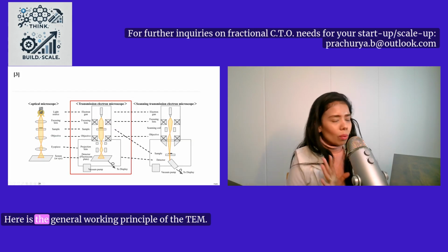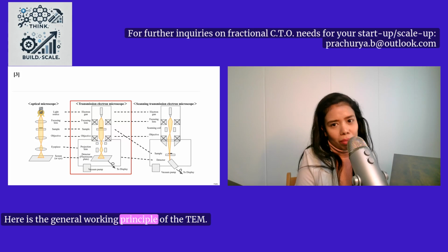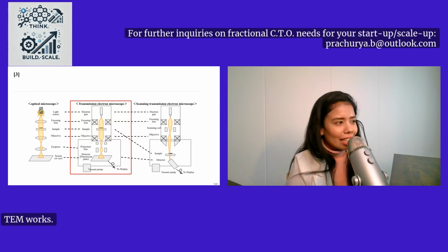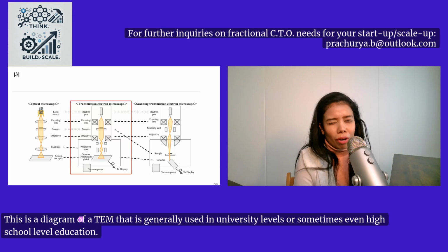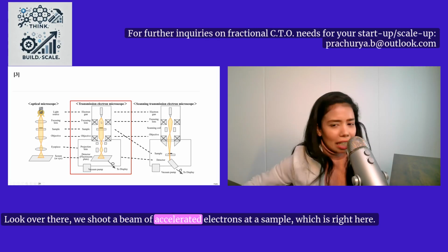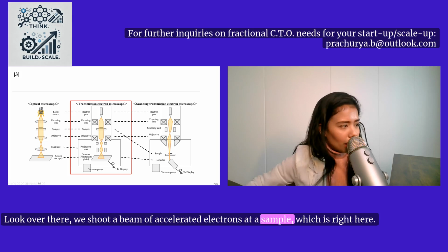Here is the general working principle of the TEM. This is a diagram of a TEM that is generally used at university levels, or sometimes even high school level education. Look over there, we shoot a beam of accelerated electrons at a sample, which is right here.